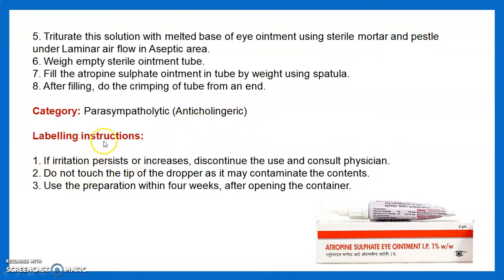Labeling instructions are mentioned on the label, like if irritation persists or increases, discontinue the use and consult the physician. Do not touch the tip of the dropper or the tip of the tube, as it may contaminate the content. Use the preparation within 4 weeks after opening the container. Then we move toward the laboratory.